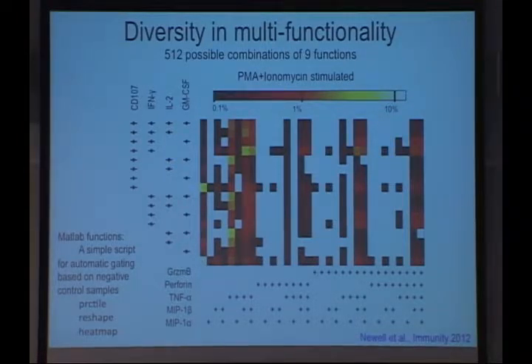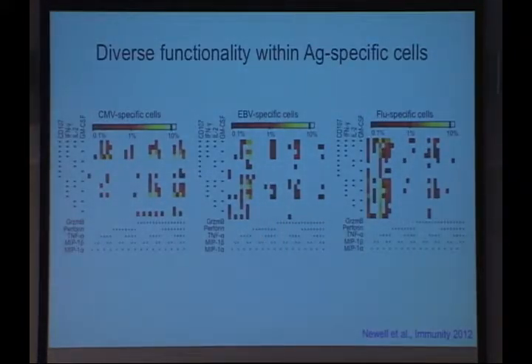And so this is total CD8 positive T cell stimulated. But then when you look at cells specific for different epitopes, you get different patterns. And so we think that maybe this way of looking at the patterns of polyfunctionality could be useful, because it will say, okay, let's say one pattern is associated with one type of T cell, another pattern with another, and maybe in disease you'd see peculiarities associated with whatever it is you're looking for. So it's just another way of visualizing diversity here and taking advantage of the multi-dimensionality of things.